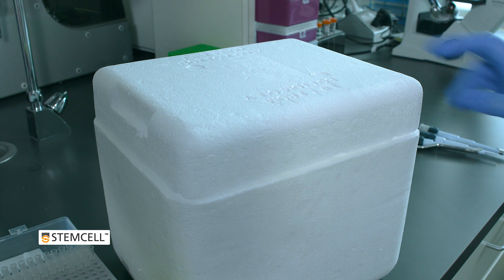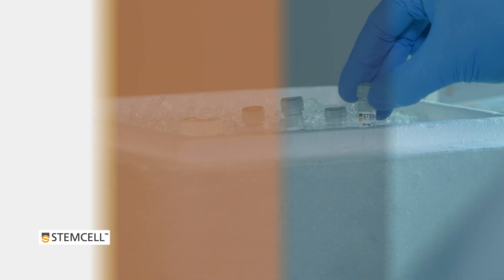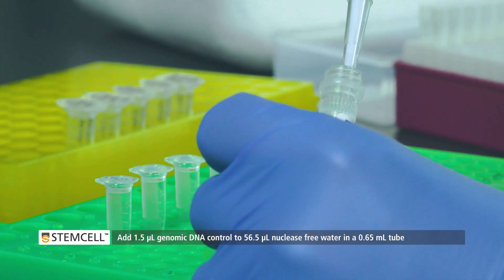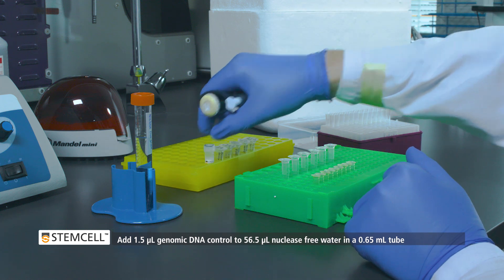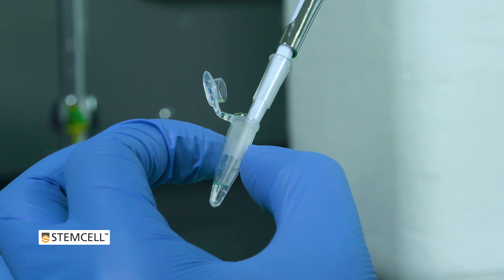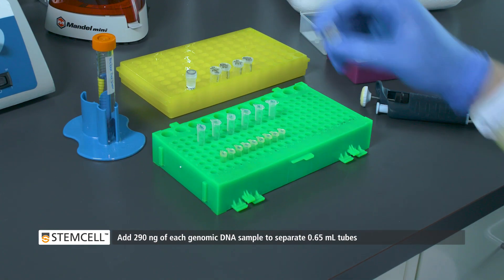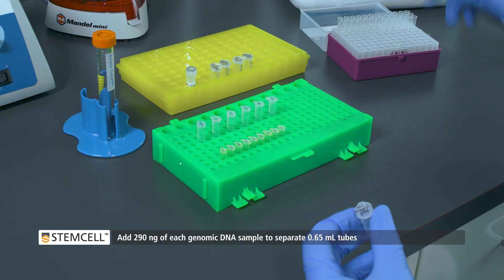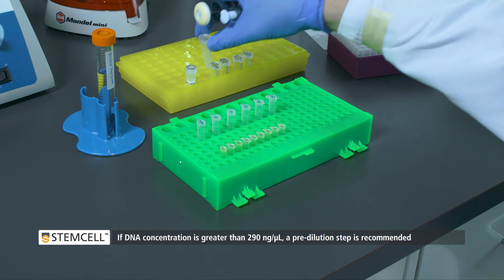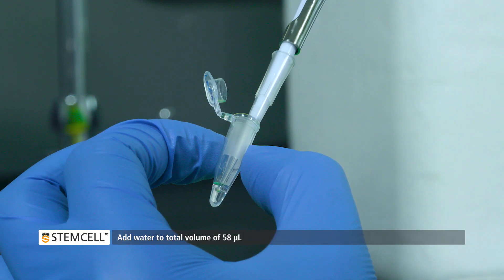The HBSC genetic analysis kit reagents are now ready for use. First, add 1.5 microliters of genomic DNA control to 56.5 microliters of nuclease-free water into a 0.65 mil tube. Then add 290 nanograms of each genomic DNA sample to separate 0.65 mil tubes, and add water to a total volume of 58 microliters.